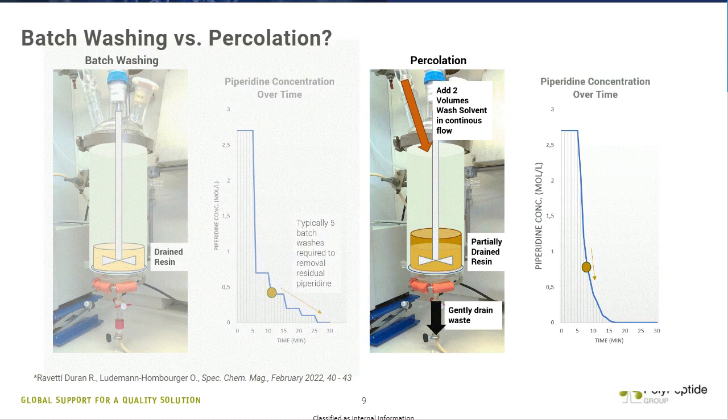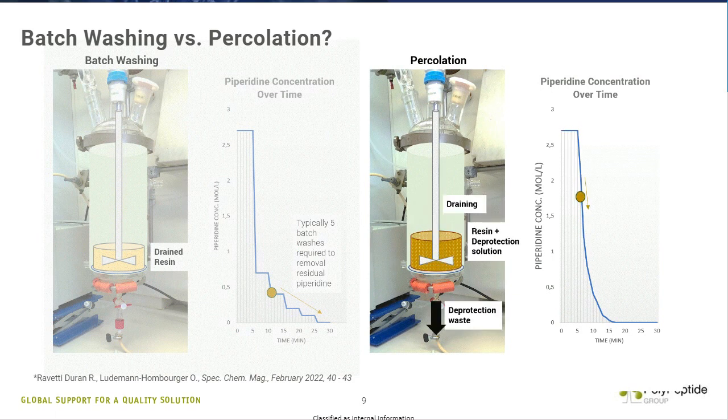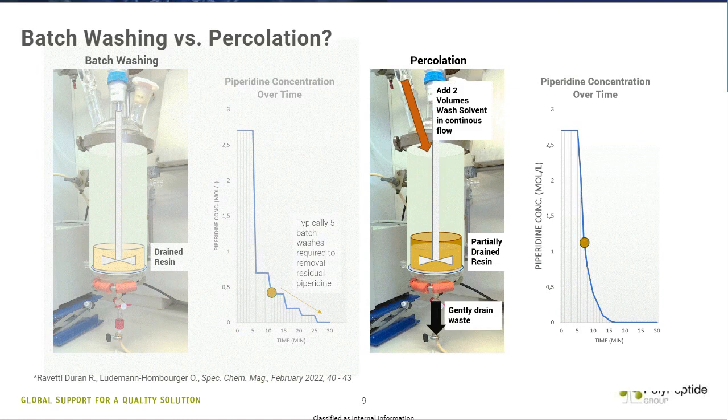Okay, one of the final questions here. You discussed the large excess of product obtained. Of course, the peptide powder contains other substances such as water and the counter ions. How do you control for this, and how do you calculate the true content of peptide in your powder?